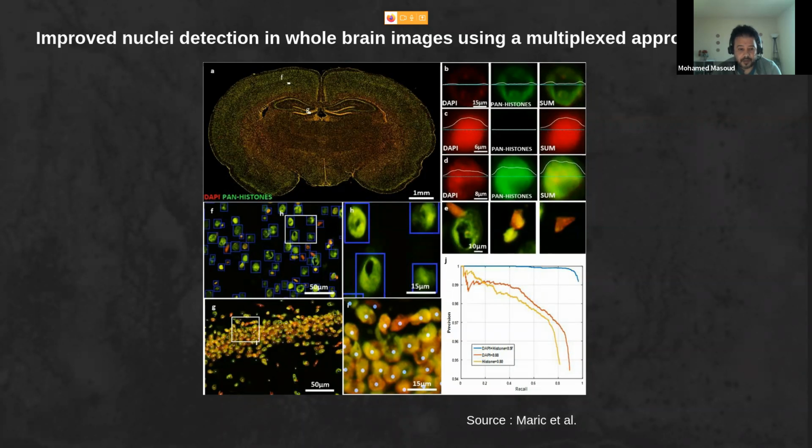They developed a transfer learning based approach to generate sufficient training samples to train the Faster R-CNN, and it was able to detect the cells. The network generates a set of bounding boxes indicating the detected cell nuclei, as we can see in the middle of this picture.